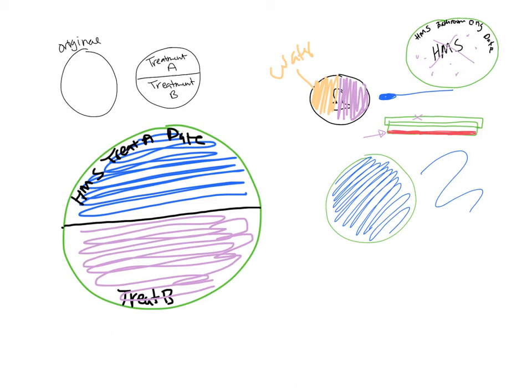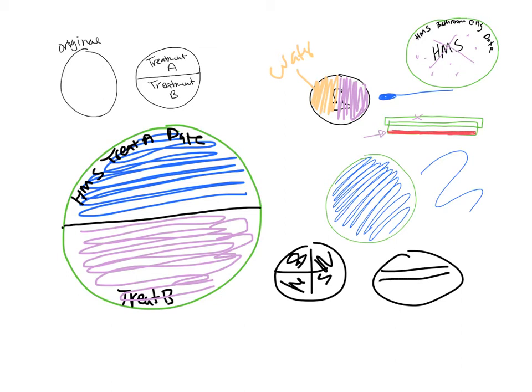And this way you'll have 3 environments, and we can save a plate. So take your third plate if you haven't used it already, and bring that back to me at school so that we can use fewer plates, because this is just as efficient. A lot of times, actually, we'll split plates up into 4s, quadrants, and plate different things on each quadrant. I've even seen ones that are like 6s, and you just plate maybe one colony or one smear in each of those. So it's not unusual to do this.